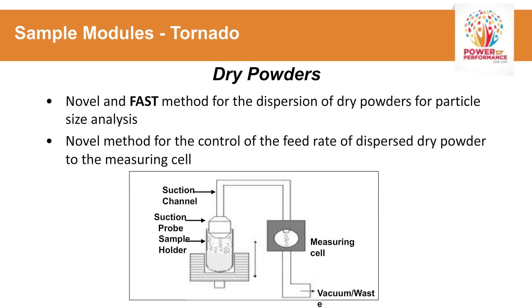This is a laminar flow cell that keeps the particle stream in a nice tight stream, so you don't have a lot of spray.